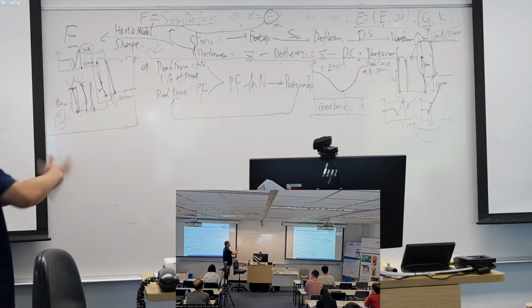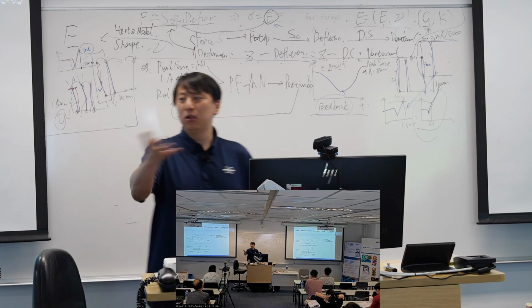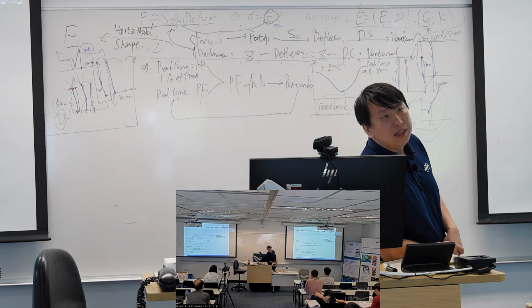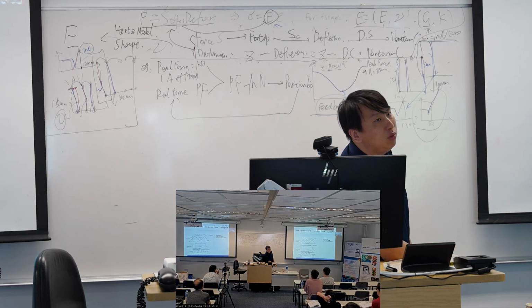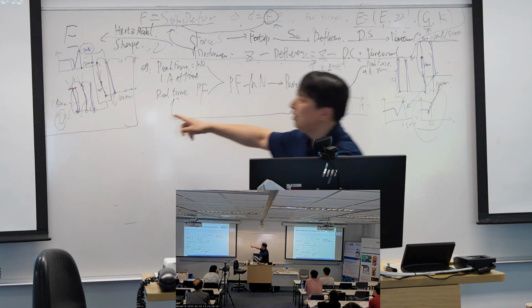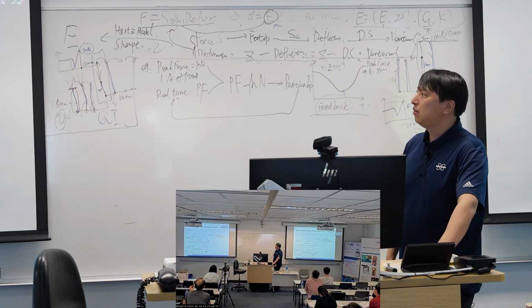Okay, so as such we can do the force curve at each point quite fast, and get nice images. I know we have some users here who are using the JPK, and on that machine you may not use PeakForce tapping very much. You may use a mechanism similar to this, and in JPK it is called QI mode.